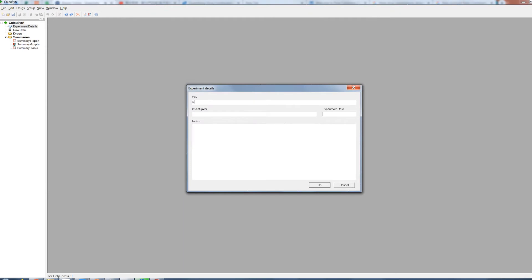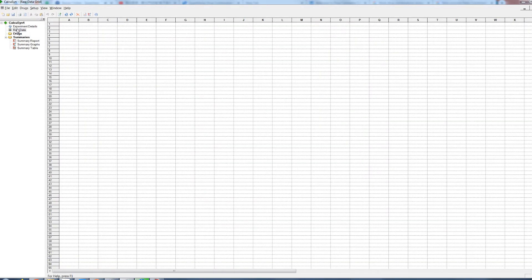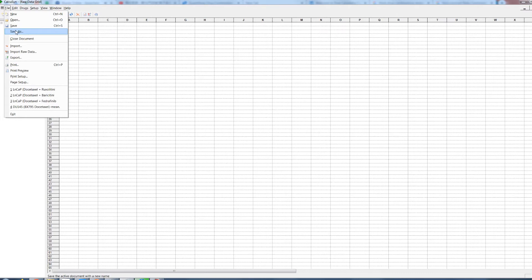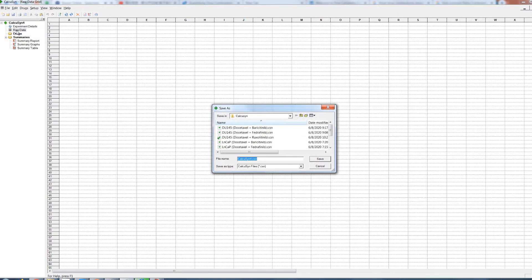To start using CalcuSyn, we will create a new experiment. Go to File > New to create a new experiment. The left-hand pane will be populated with the experiment basics. Double-click on experimental details to enter the experiment properties. Double-click on raw data to open the raw data grid to enter drug data. You can save an experiment using File > Save or open an existing experiment with File > Open.